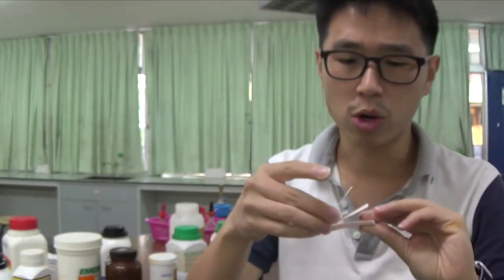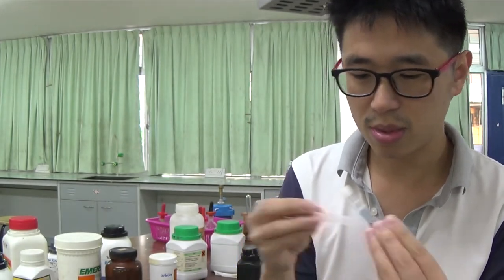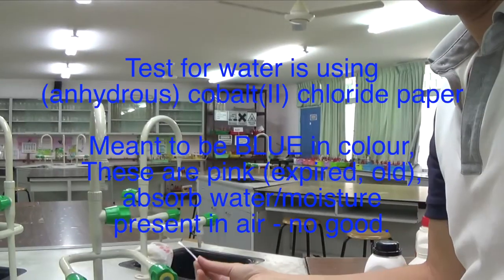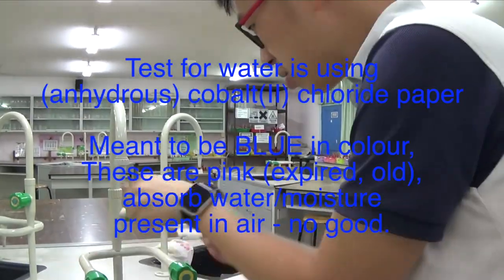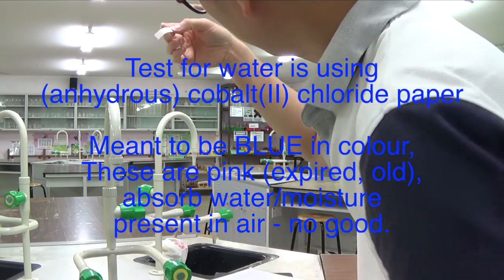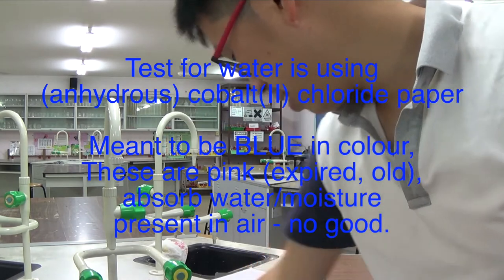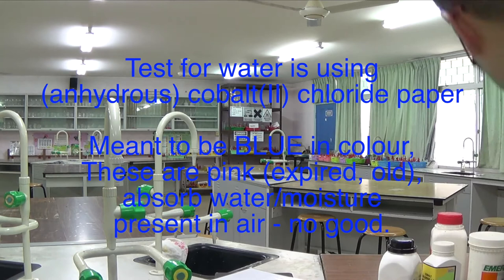In the presence of water, I am just going to take one strip, and of course this is tap water, but tap water is still water, so I'm going to add water to it. It is not very good at all. It's not meant to be pink, by the way. It's not meant to be pink, okay? So I stand corrected. It's not meant to be pink.